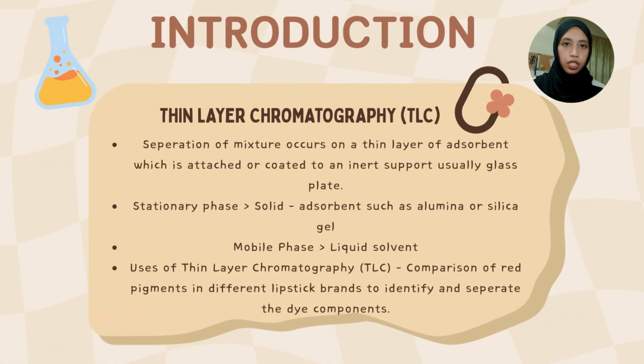In this video presentation, we would like to introduce one of the techniques in chromatography, which is thin layer chromatography, or TLC. TLC is a method used to separate the components of a mixture. This separation happens on a thin layer of adsorbent material, which is coated onto a solid surface, usually a glass plate. There are two key components in this process: the stationary phase and the mobile phase.